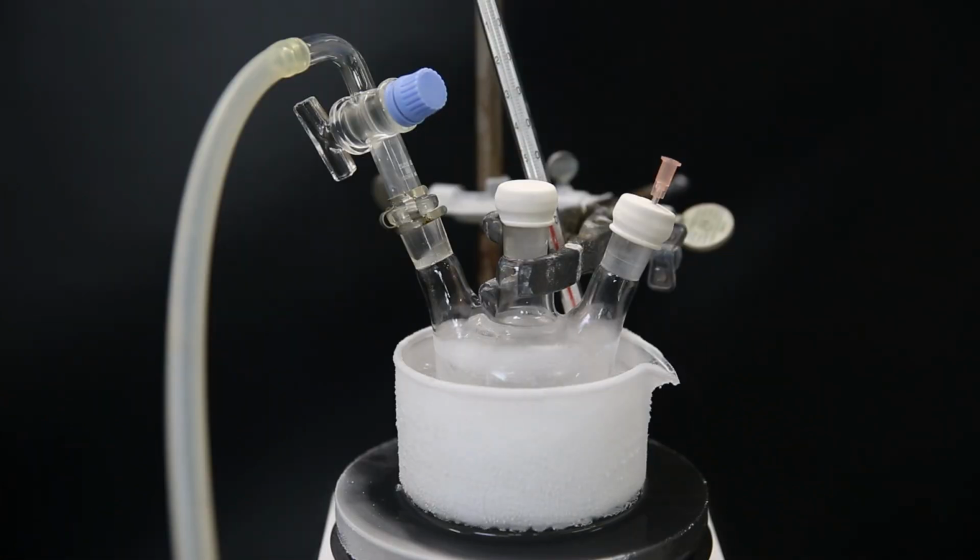After a while, it has cooled down to about -70 °C, and I closed off the remaining necks with septa. I also attached a nitrogen line, with a needle serving as the exit. Then under nitrogen flow, I add 7 ml of pentane as a diluent.